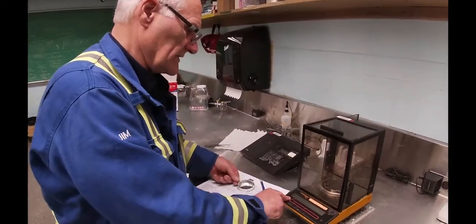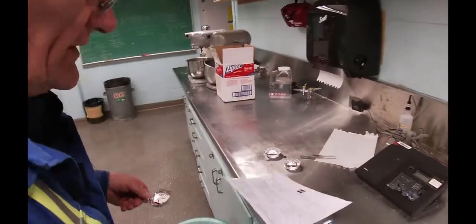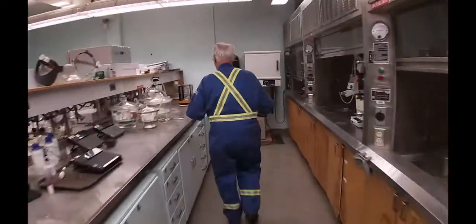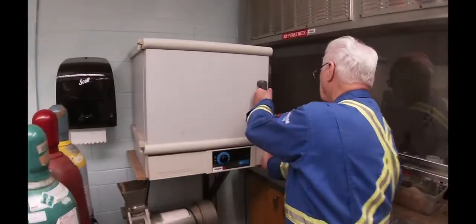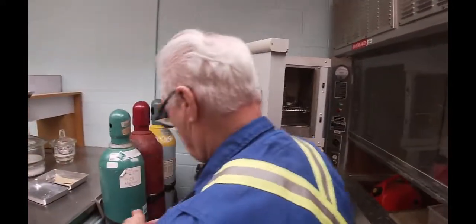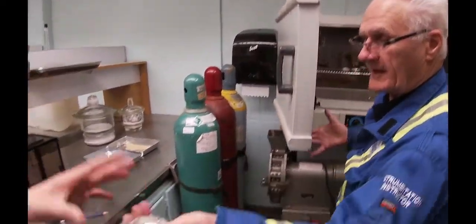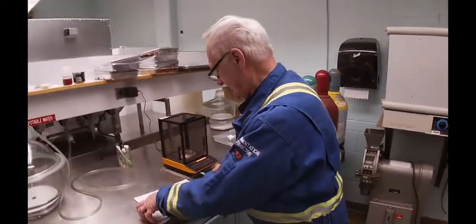Now what we're going to do is shut this off and take these over to the oven. We will let them dry out for a day — 24 hours.